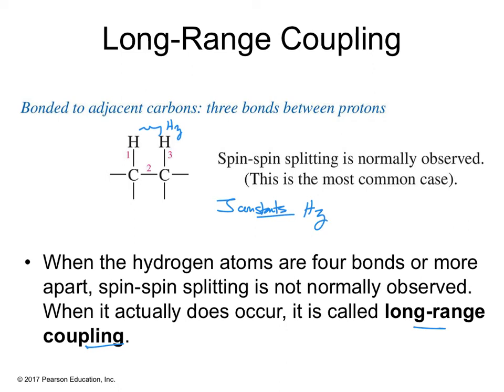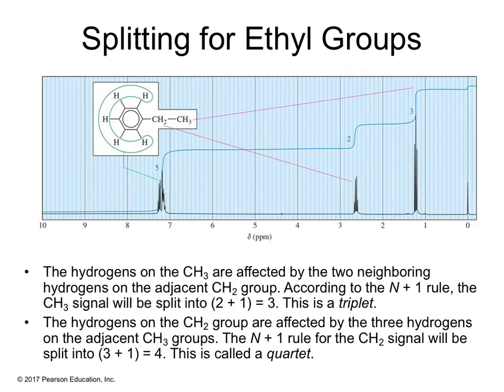And if they're related to each other, then you can say they have the same J constants and they are related to each other. We don't go into the J constants here. That's probably more of a graduate level, upper grad. I just want you to be able to do the 4 things. I want you to be able to look at this spectra here and say, okay, we're going to have 3 peaks, because we've got NMR peaks.